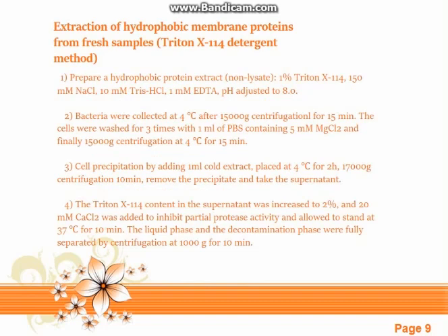Extraction of hydrophobic membrane proteins from fresh samples. Triton X-114 detergent method. 1. Prepare hydrophobic protein extract, non-lysate: 1% Triton X-114, 150 mM NaCl, 10 mM Tris-HCl, 1 mM EDTA, pH adjusted to 8.0.